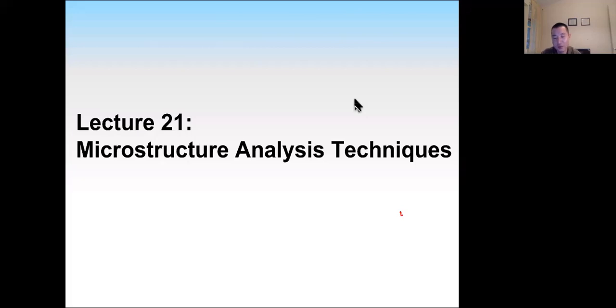All right, so lecture number 21, microstructure analysis techniques. So I think this week we're going to talk about techniques for microstructure analysis of concrete and other materials. We are going to talk about scanning electron microscope, SEM, XRD, which is X-ray diffraction method, MIP, which is mercury intrusion porosimetry, among other methods.